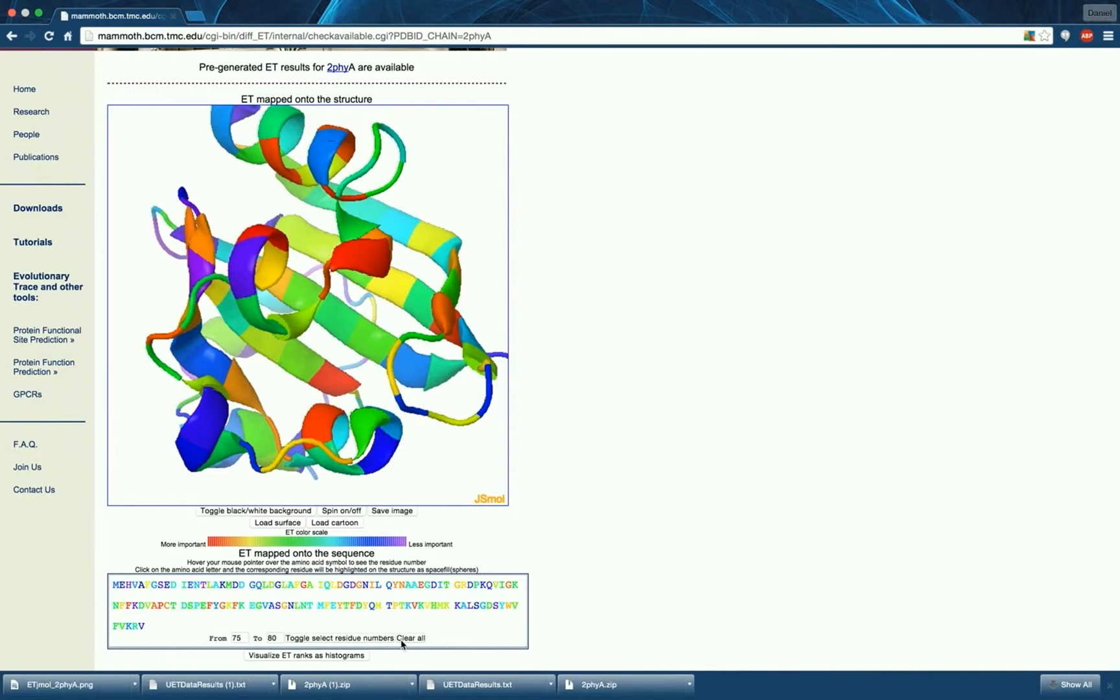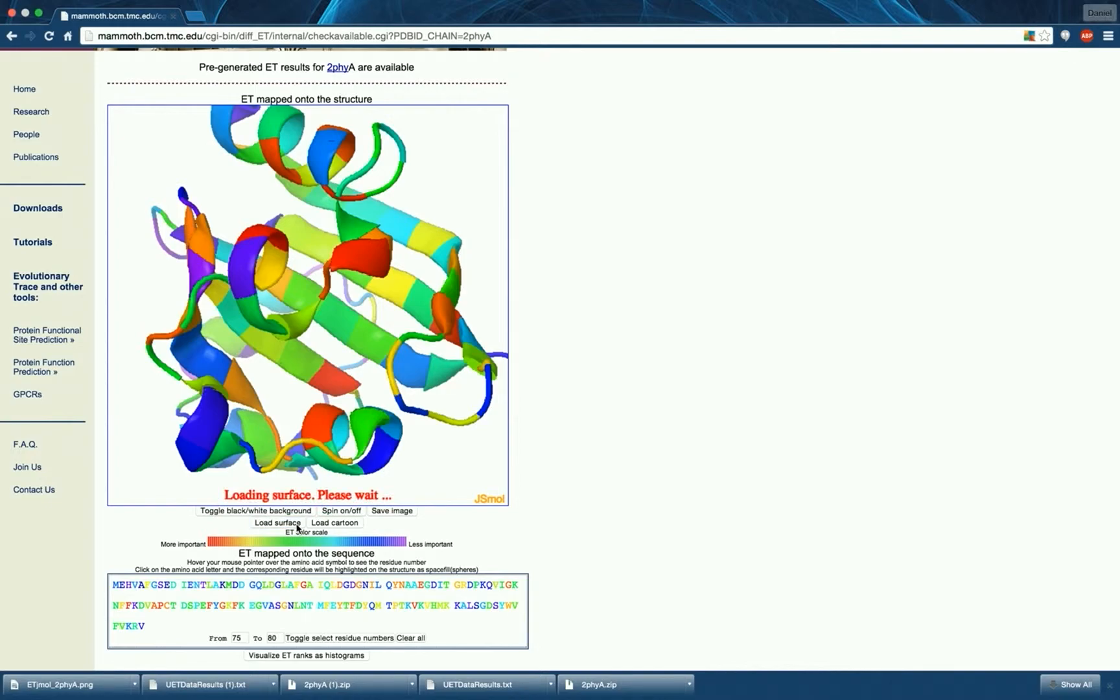Finally, you can load a surface representation of the molecule instead of the cartoon by pressing this button. The surface representation may take a few seconds to load. Please be patient.